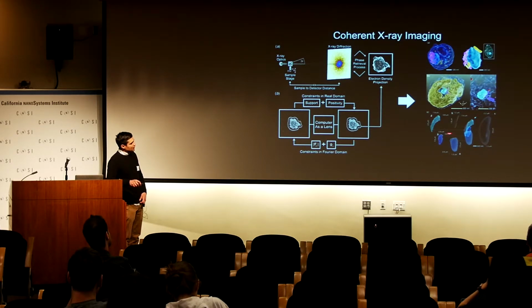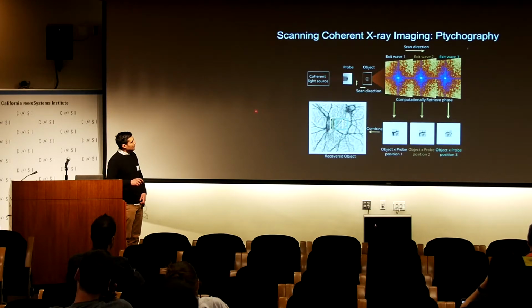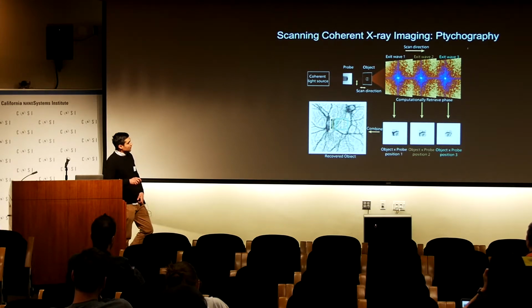In other cases, you can see different types of cells have a different morphology, and that's been able to be captured here, and you can also see subcellular structures in there.